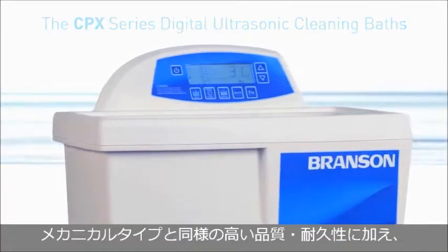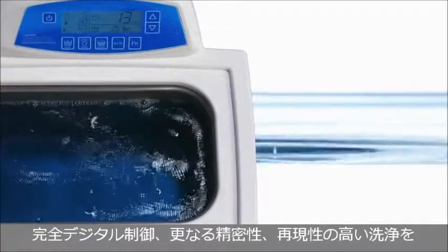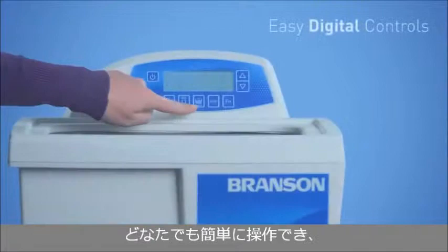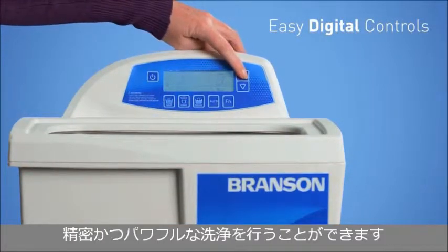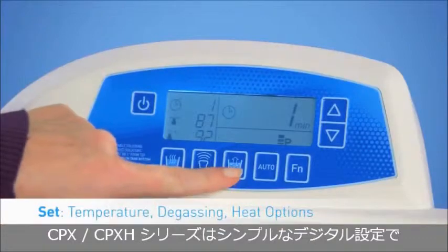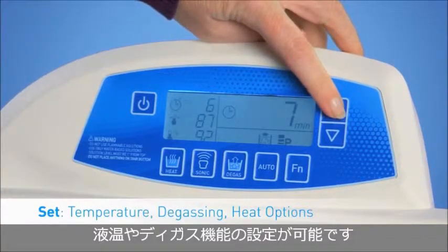Built with the same quality and durability as our mechanical ultrasonic cleaners, we've reimagined the Bransonic bath for complete control, enhanced precision, and consistent cleaning for any user. It starts with a newly designed clear digital display. These easy-to-use controls give any operator the ability to perform precise, powerful cleaning with limited room for error. Depending on the CPX series, you'll notice simple digital controls that range from temperature setting to degas processing to heating.